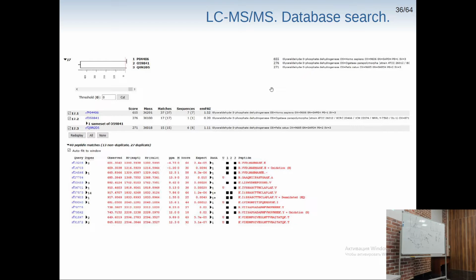First of all, what we should look for are mostly unique or signature peptides, or peptides which can be unique. Let's count. We have 1, 2, 3 unique peptides for Homo sapiens, and we have 1, 2 peptides for cat.